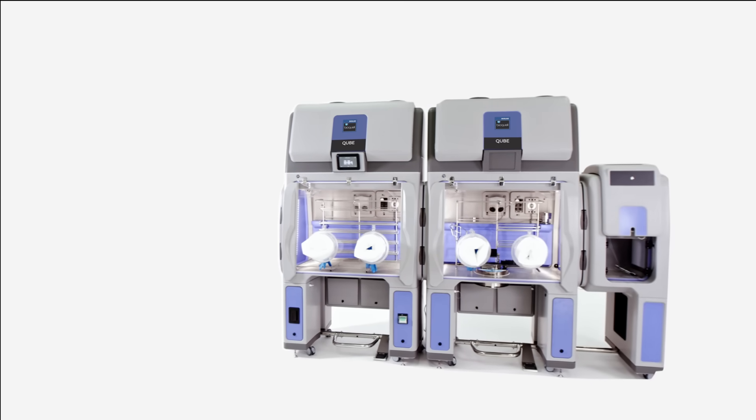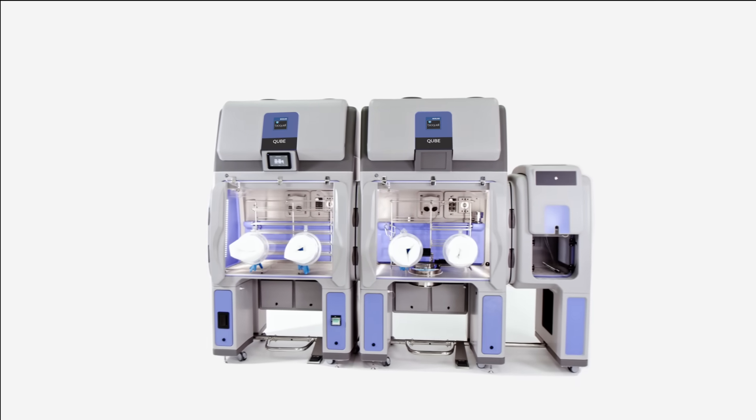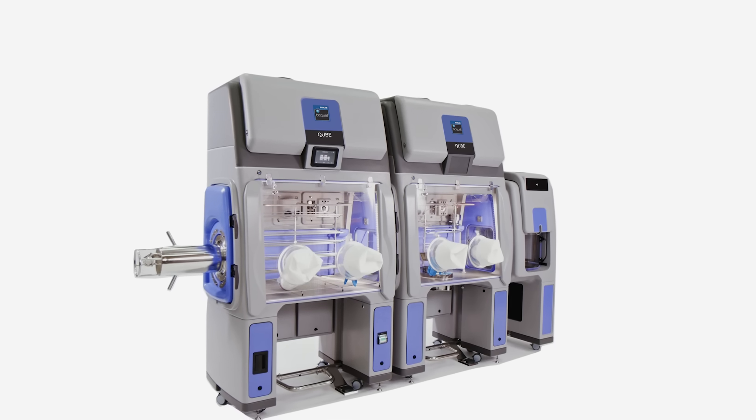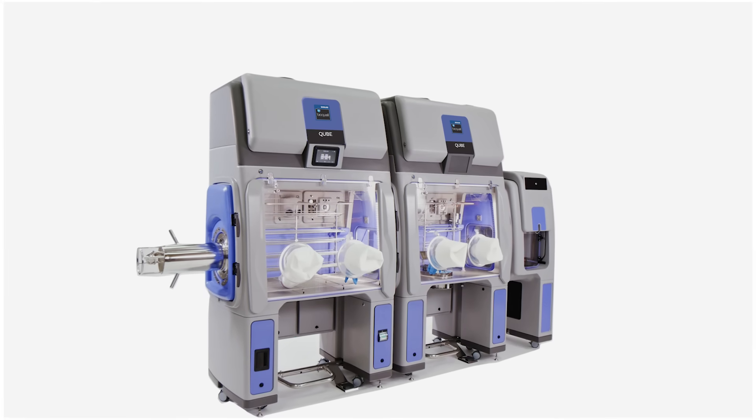The BioQuell Cube is an efficient, reliable, and easy-to-implement system for biopharmaceutical, laboratory, research, and biotechnology clients.